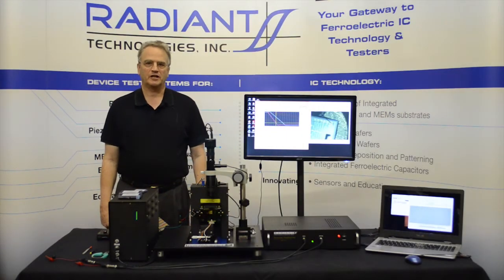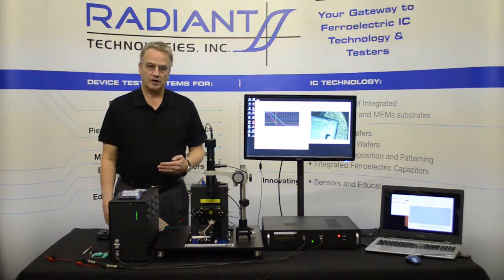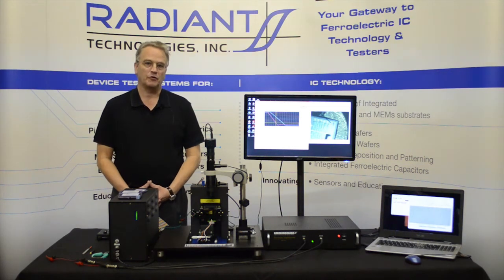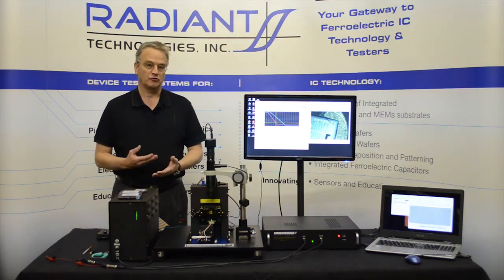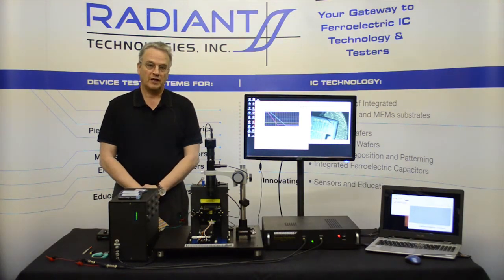Hi, my name is Joe Evans. I'm from Radiant Technologies. In this video I'm going to execute piezoelectric measurements of a thin piezoelectric film that moves a few angstroms, and then a piezo-MEMS type device that will move more than two microns. For this purpose I'm going to use the Radiant AFM reference. The AFM reference delivered with its mounting fixtures is delivered with every PNDS. If you desire more, contact Radiant Technologies or visit us at www.ferrodevices.com.